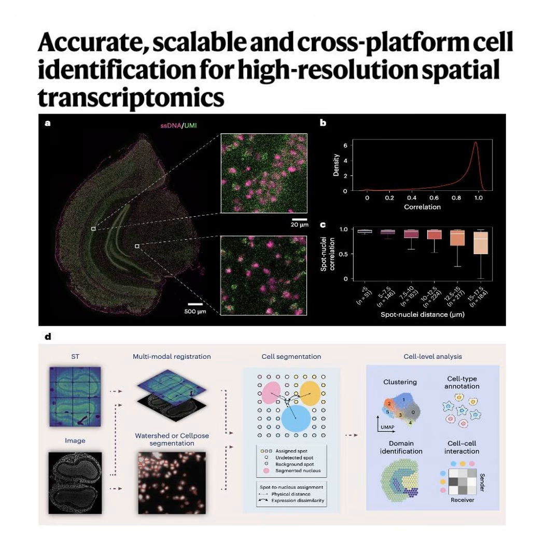Alpha is basically a slider. If you crank it one way, the algorithm heavily trusts physical proximity. It assumes RNA didn't float very far. And if you crank it the other way? It trusts the genetic matching. It says, hey, this RNA belongs to that cell because it looks exactly like that cell, even if it drifted pretty far across the slide.